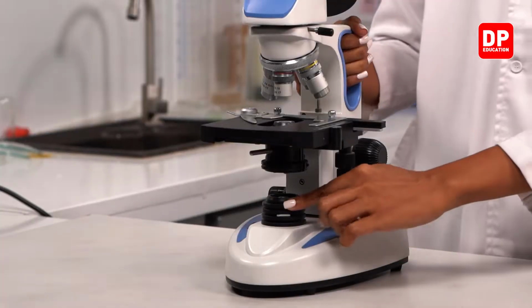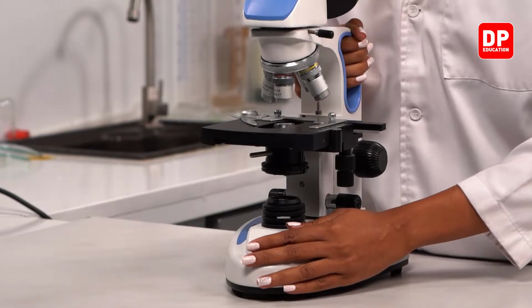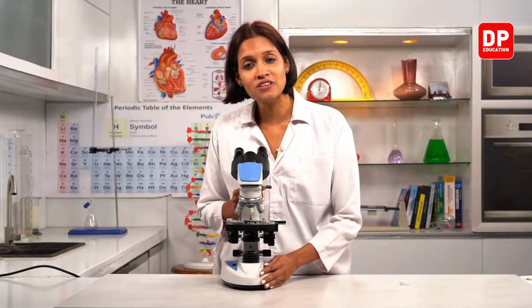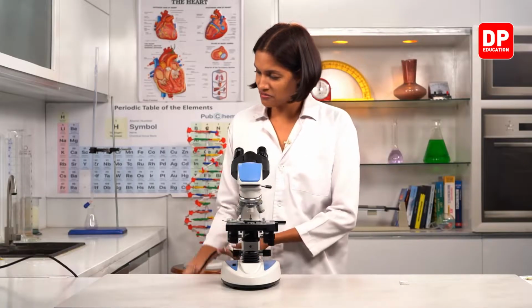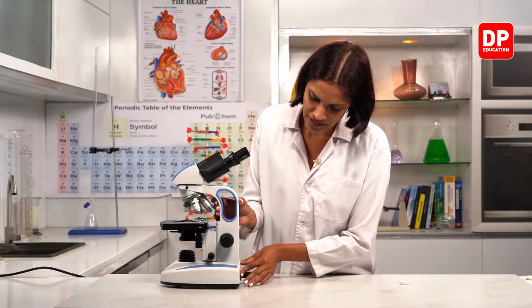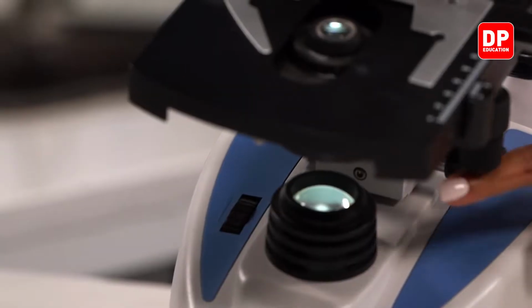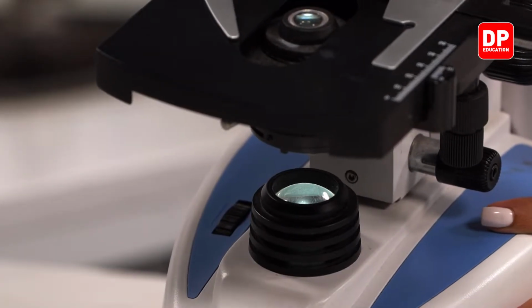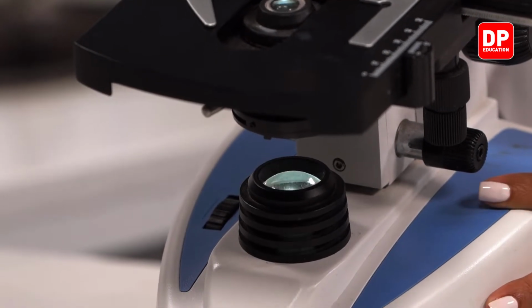Now look at this one. What is this, children? Now this is a developed microscope, as I told you all before, right? And at the same time, you all know that this microscope needs a beam of light in order to observe the specimen. Here, this is a light bulb. Now there's a wire connected to this microscope and there's a switch here, right? So when I turn on the switch, you all can see there's a light. Okay, children, I will switch it off. You can see it goes off. Now again, I turn it on.